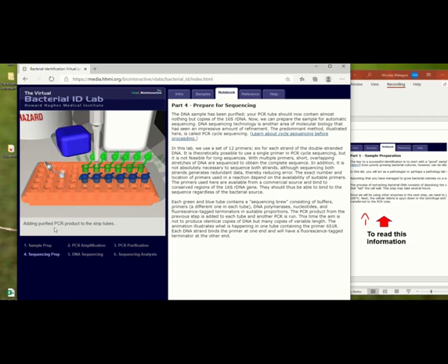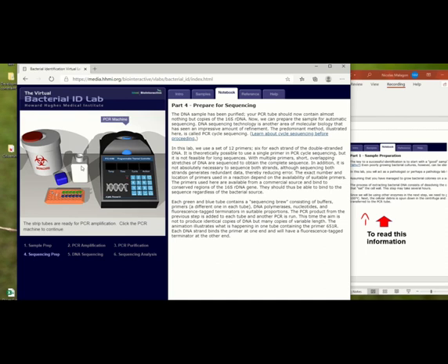And here, they will tell you all the steps again. Sometimes there are pipettes that instead of having one, they have multiple pipettes at the same time, so you only pipette one thing 6 times, and in that way you can save time.